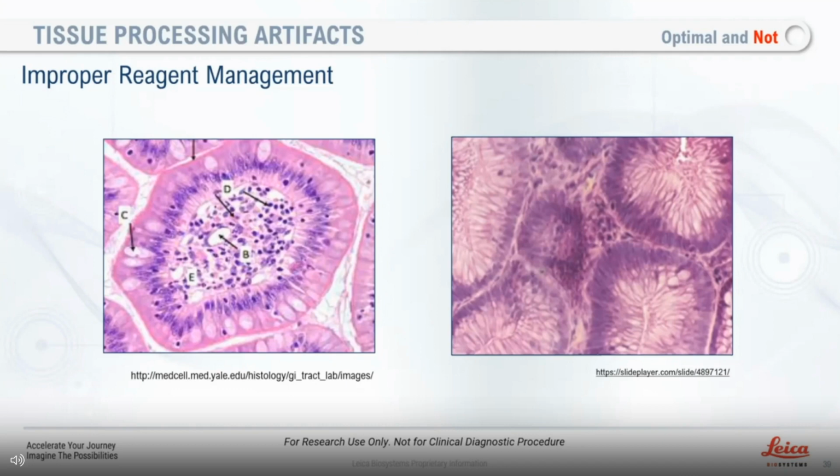Right. Next question. Can paraffin expire? And if so, can it be used if it's expired? I do know that when you purchase paraffin, it does have an expiration date. Paraffins come in all different types of flavors, right? And it's all about the polymers that they put in paraffin. So if it was expired, I would try not to use it. I would not use that paraffin.